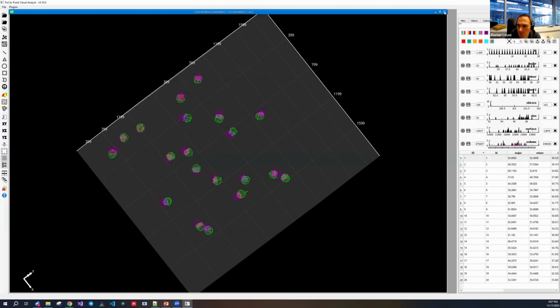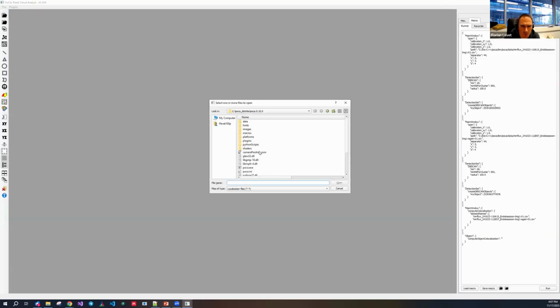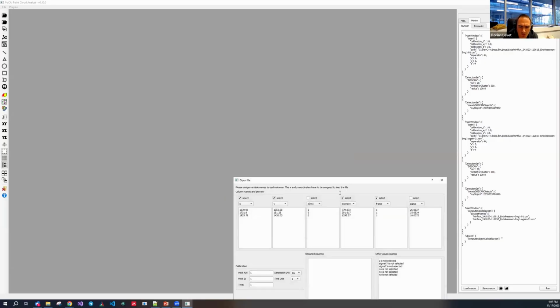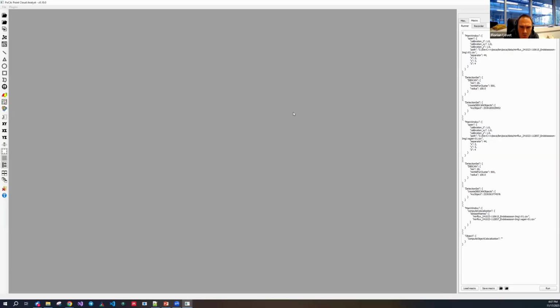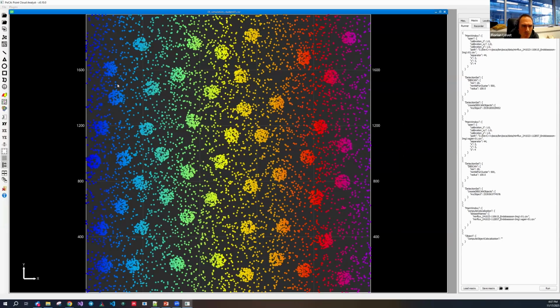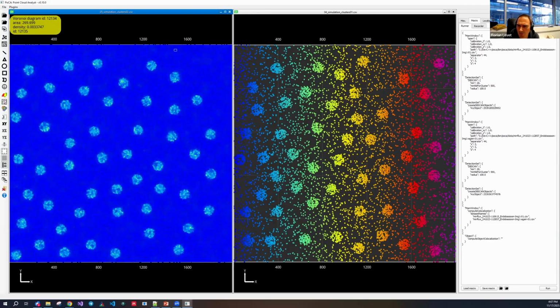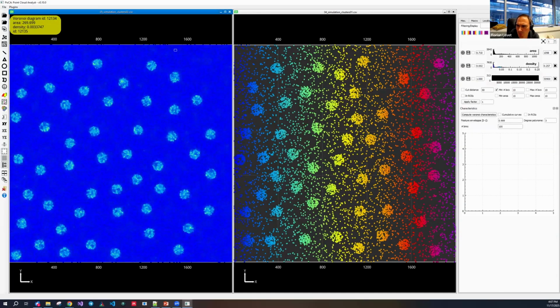And then I think if I'm going, for instance, to some 2D, oh, yes, this is more dense, okay. But maybe the Voronoi diagram won't work. I think I have a bug right now.